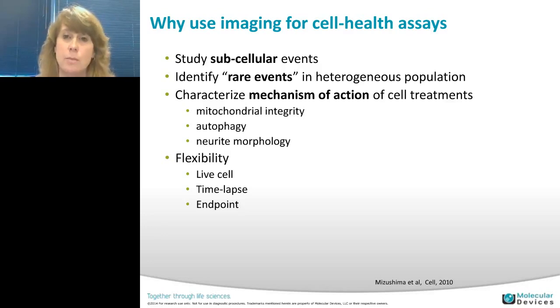Imaging gives you the flexibility to do live cell assays, and it can be done in time-lapse. Movies can be generated. You can see what's happening in real time. Time-lapse assays can be done very quickly, in only a few minutes, or for several days. And then, in addition, of course, you can do endpoint assays using the fluorophores.